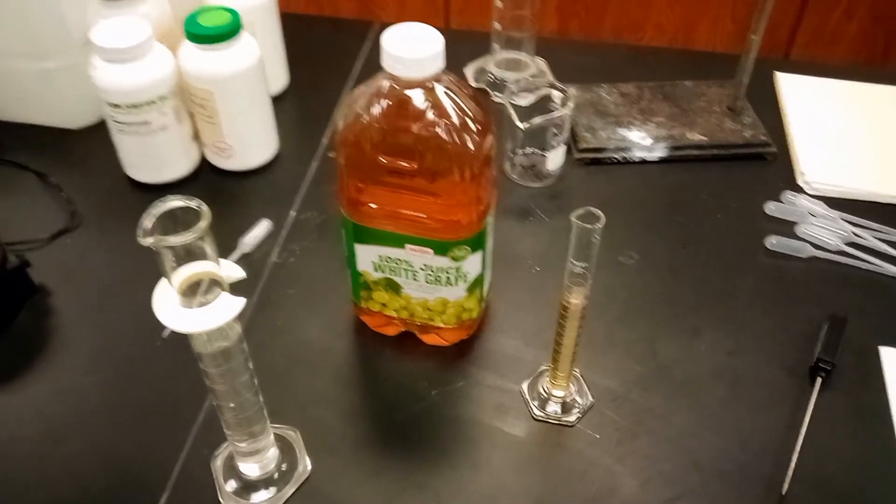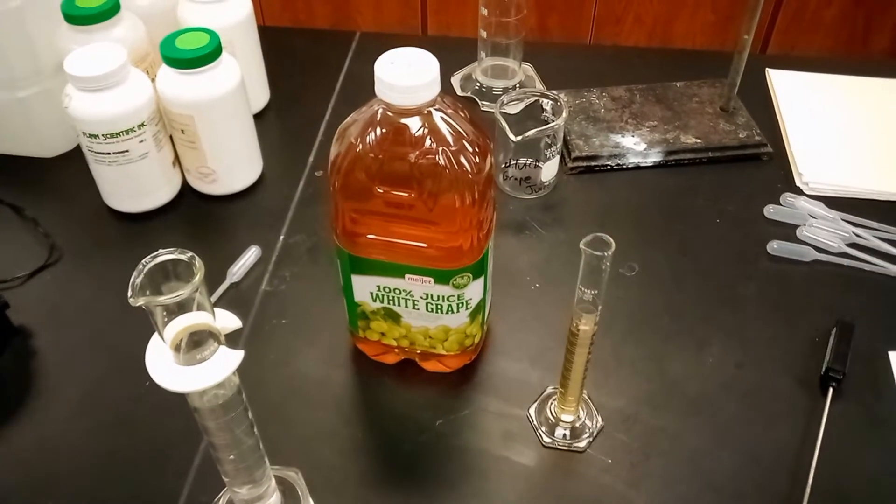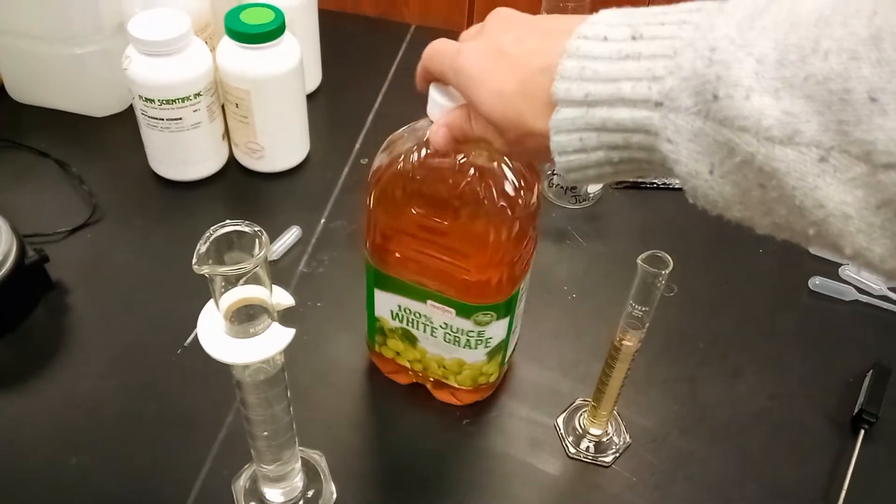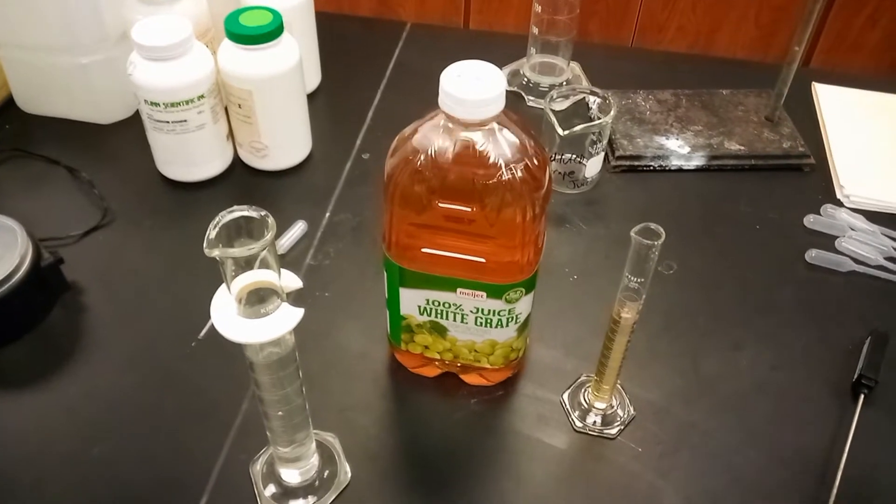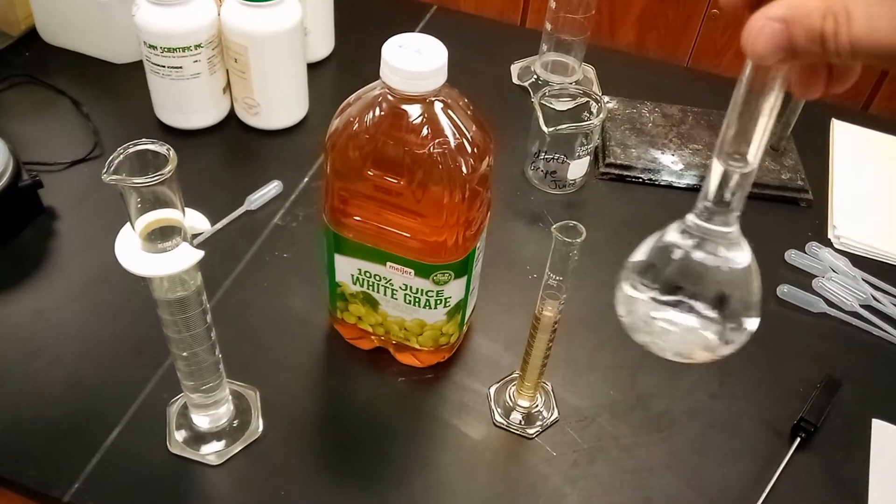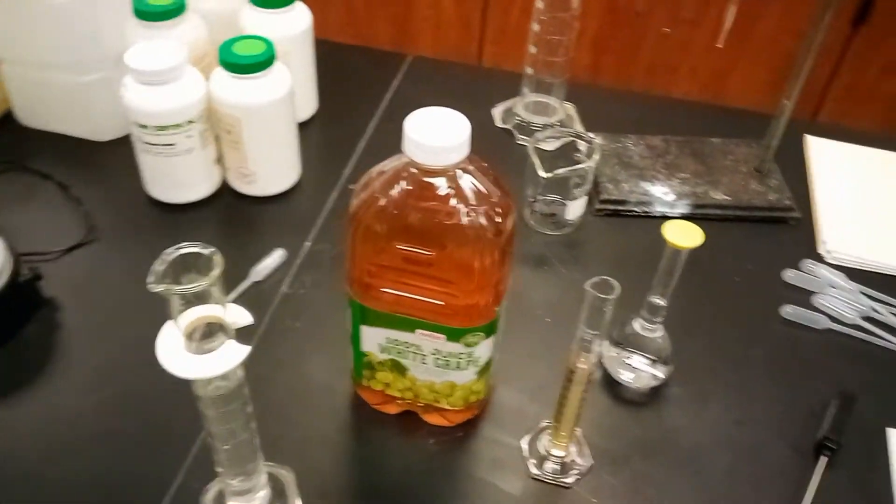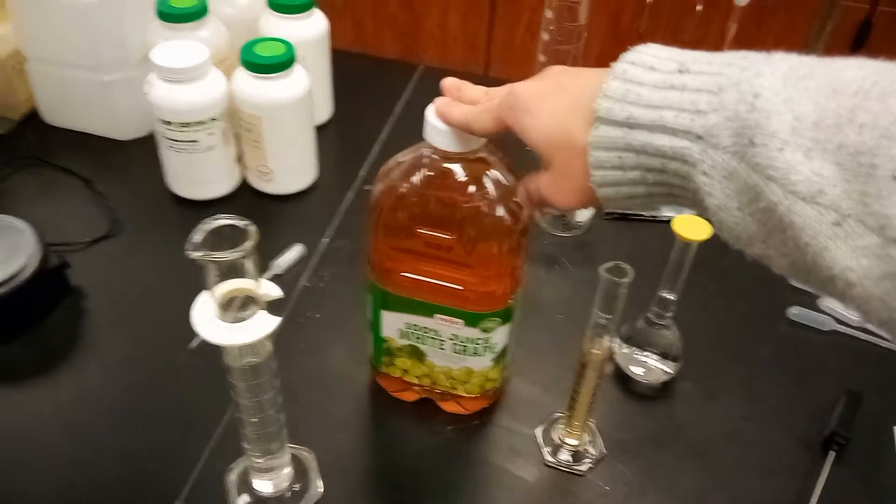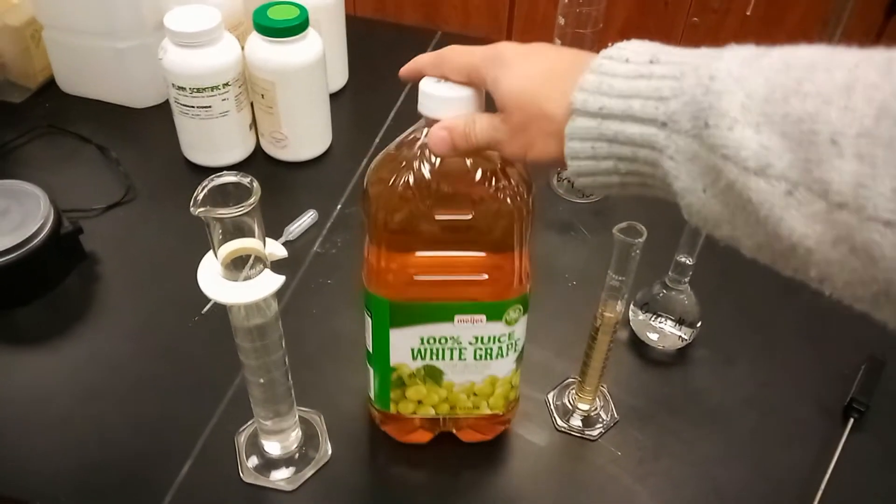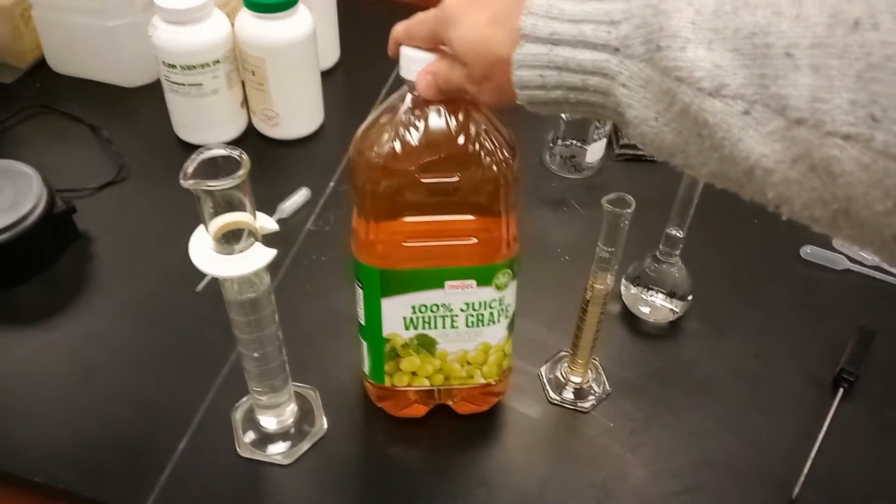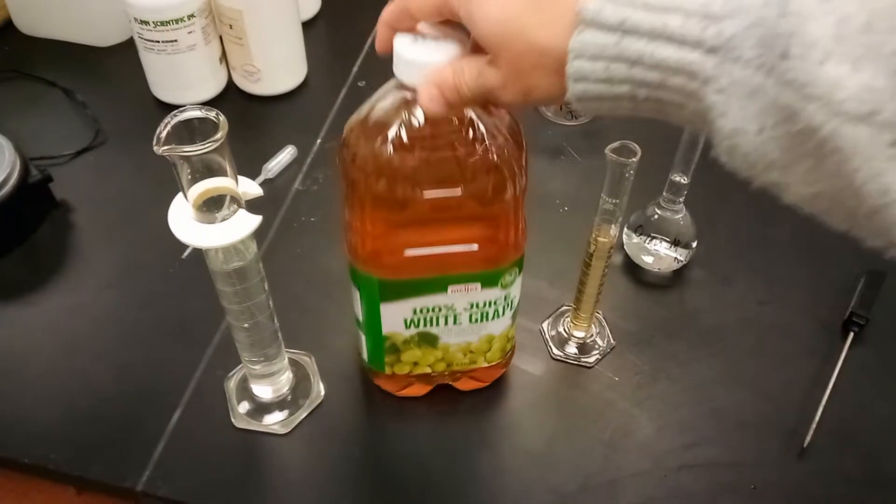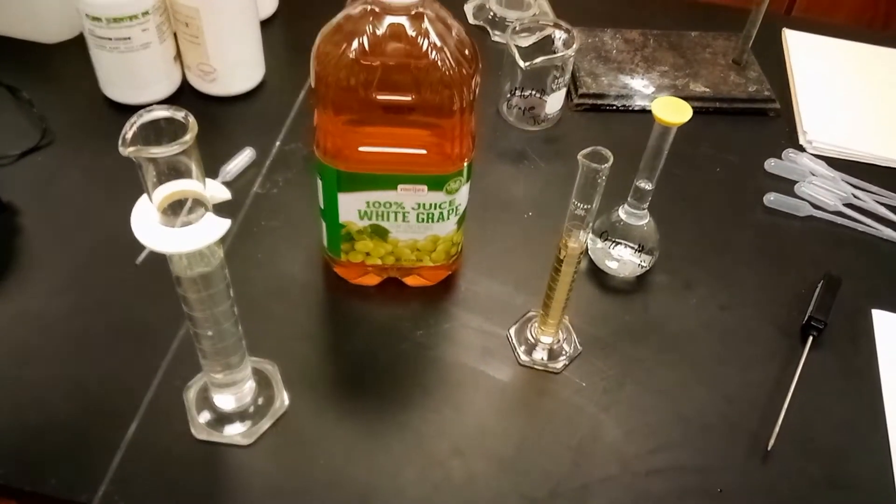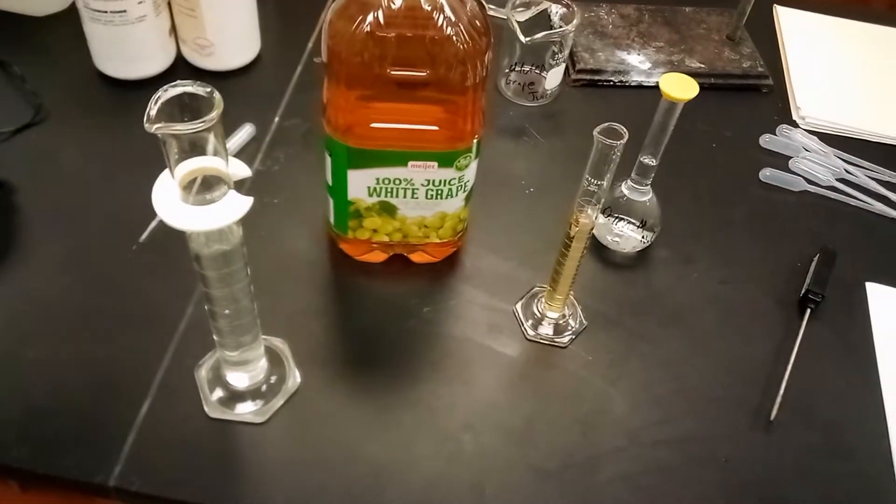So this is the beginning of a simple titration lab, and we'll be titrating this white grape juice here with some strong base sodium hydroxide. The goal is that there is acid, a naturally occurring acid in juices like this called citric acid. This is 100% juice but it has citric acid in it because it's naturally occurring. So we're basically going to find out the concentration of that citric acid in our juice.